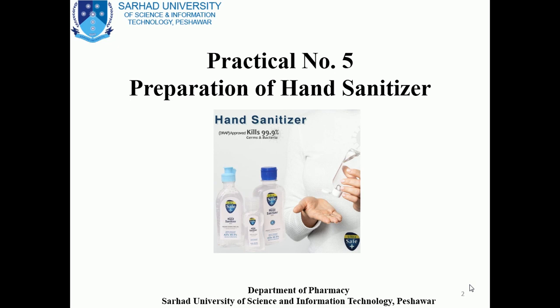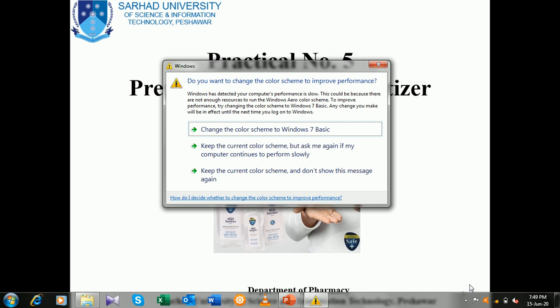approved the formulation to the local pharmaceutical industries countrywide to prepare the hand sanitizer to overcome the need of the people and the life. Preparation of hand sanitizer.